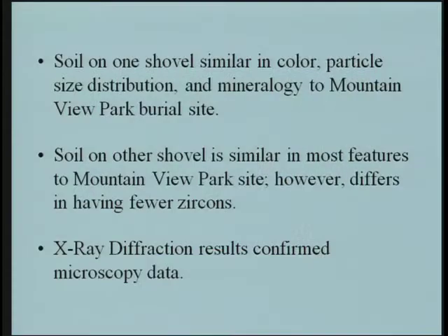Well, soil on one shovel was similar in color, particle size distribution, and mineralogy to the Mountain View Park burial site. Soil on the other shovel was similar in most features, but it did have fewer zircons than that at Mountain View Park. X-ray diffraction results confirmed the microscopy data.